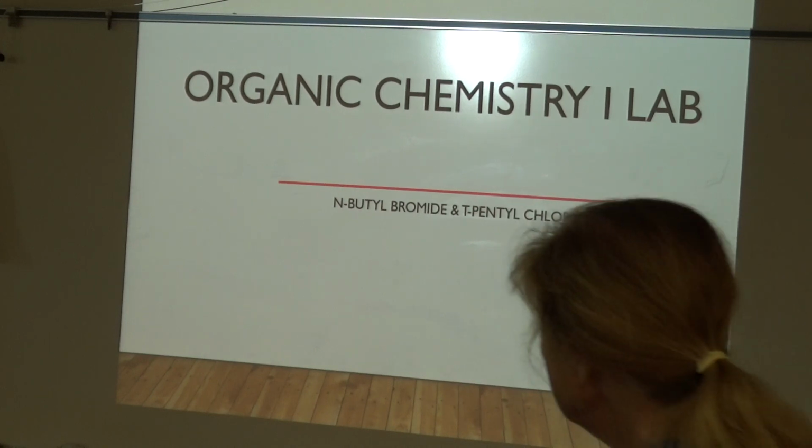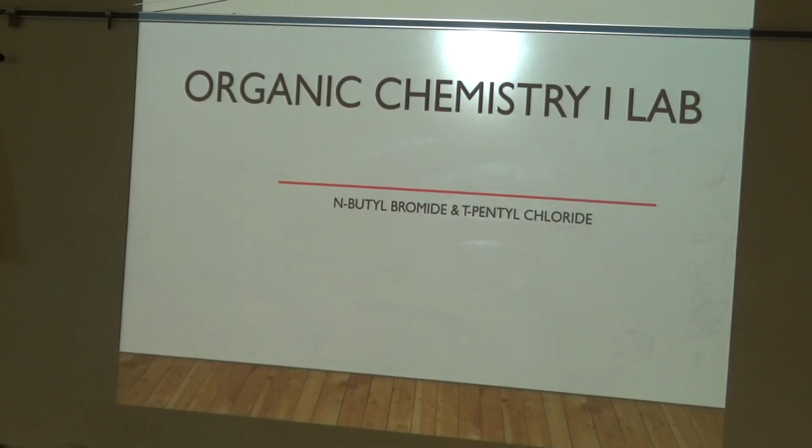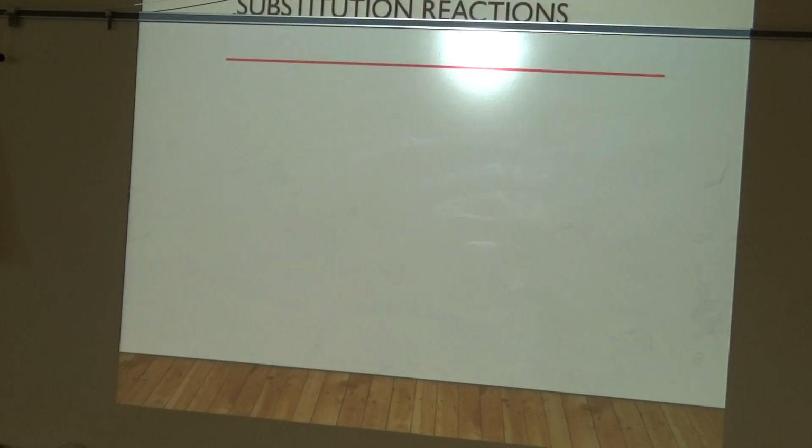All right, the final lab is actually two labs in one. It's kind of our two-in-one lab: the production of n-butyl bromide and t-pentyl chloride. Two different labs in the same lab period.